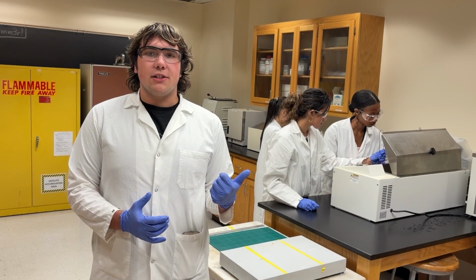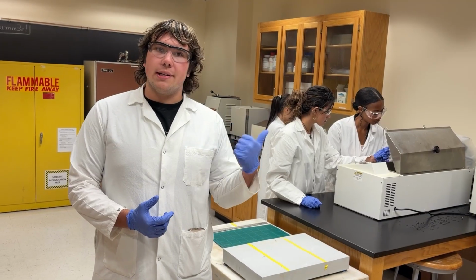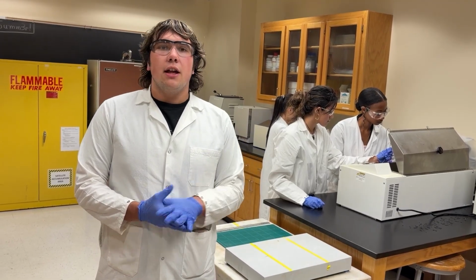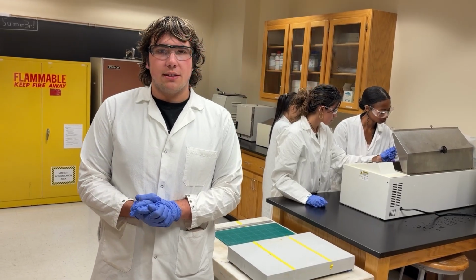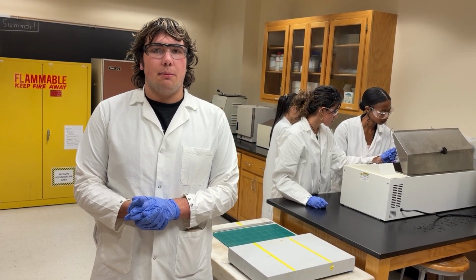A quick mention on teamwork. Notice how some of them are doing one task while some of them are doing other tasks. This is very important in the lab. Have people doing different things at different times to ensure quick and timely lab experiments.